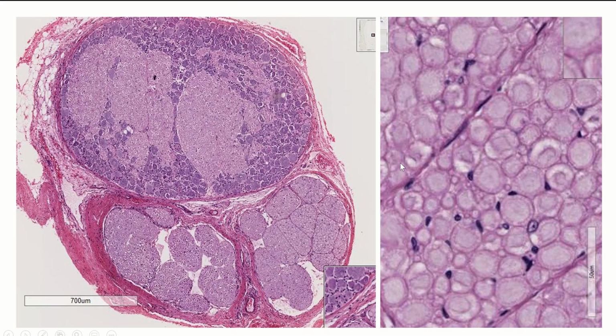Some connective tissue. Okay, so here is a real histology example of that. And you can see this is one really big nerve, right? One really big nerve. And so it has a bunch of connective tissue around it, right? So if you zoomed in here, you could see a bunch of fibroblasts, a bunch of collagen bundles, everything like that.